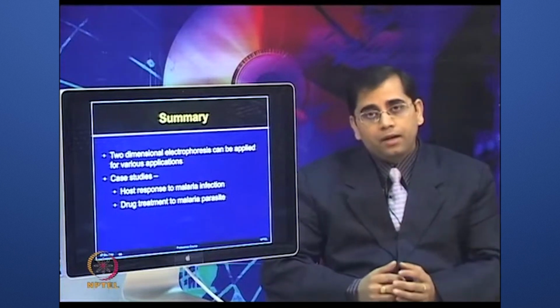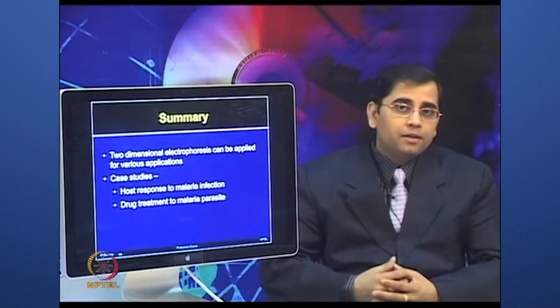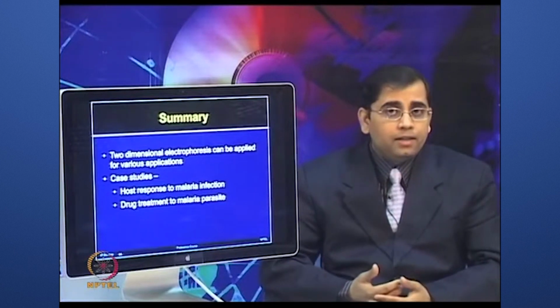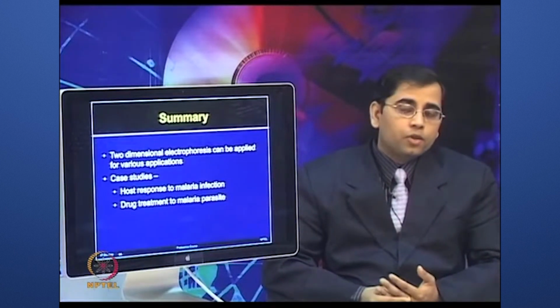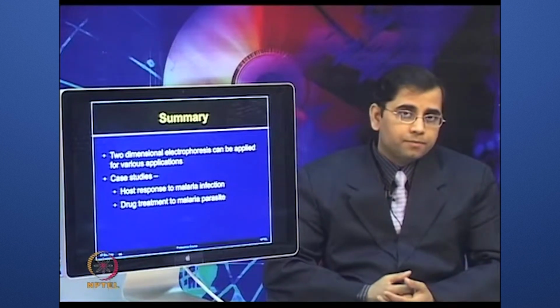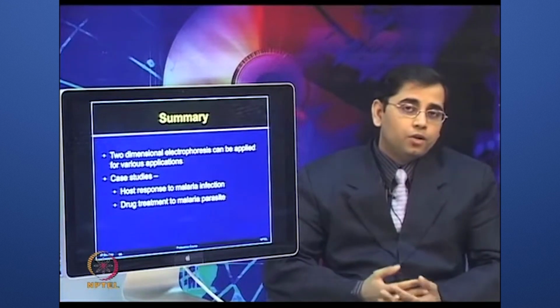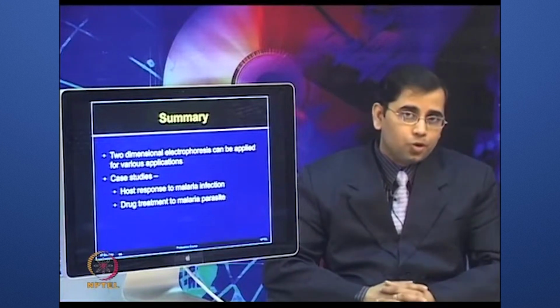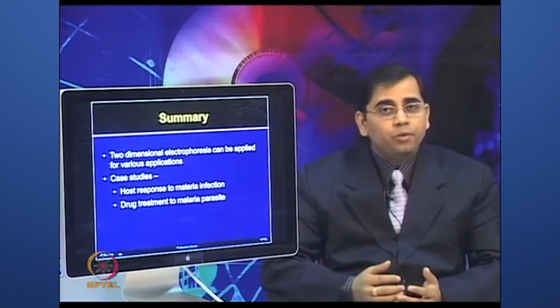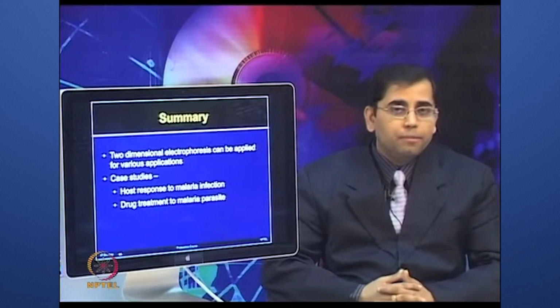If you can increase the overall proteome coverage, so that you can separate over 1500 to 2000 proteins on the gel reproducibly, then you have a good chance of identifying various potential targets, which could be novel drug targets or potential biomarkers. But if you have not done the proper quality control experiment, you have not optimized the protocols properly and your proteome coverage is very poor on the gel, then you are comparing only a partial proteome, and there is a good likelihood that you will miss many important changes.